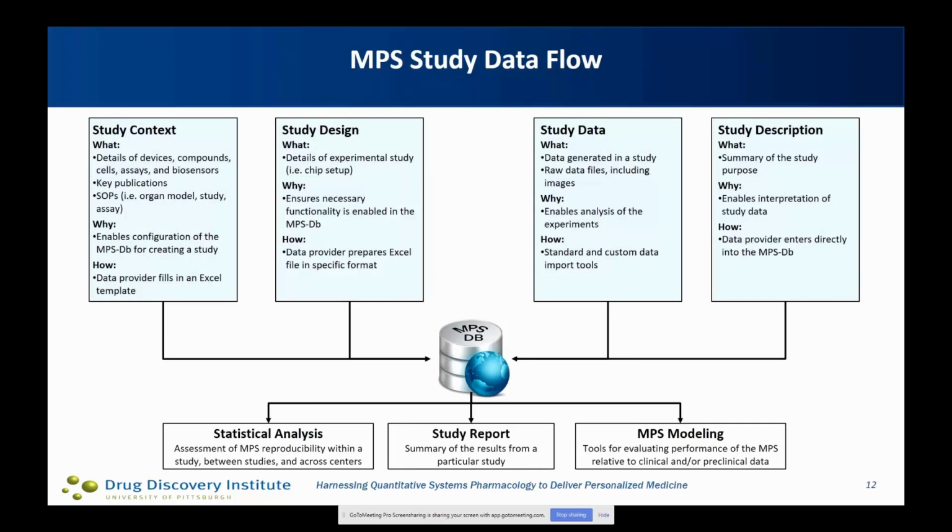So the workflow in terms of capturing the metadata and capturing the data into the database involves interaction with the data providers in order to establish for their model the context of the model: what kind of a device is used, what kind of cells are used, how is the model constructed. All of that information gets parsed into the database, and we have some standard formats for the providers to be able to give us that data in a way that we can parse it into the database for reference access.